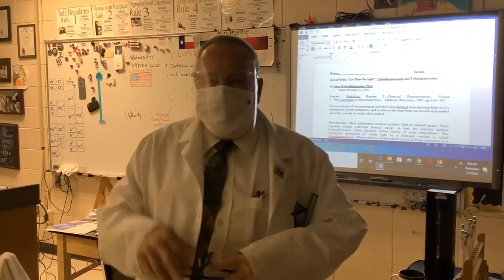I'm not going to put on my safety glasses because I'm wearing a face shield because of the COVID pandemic.